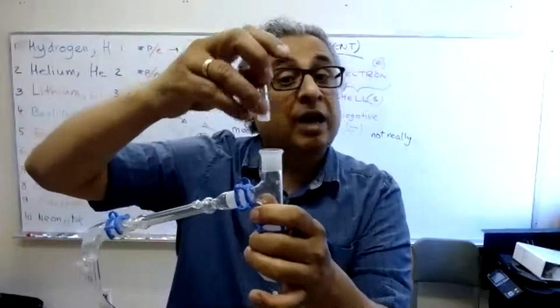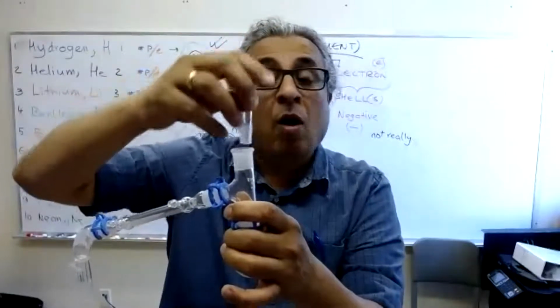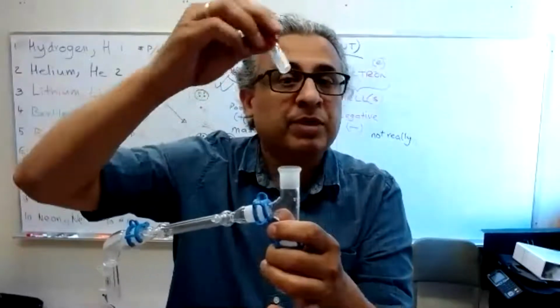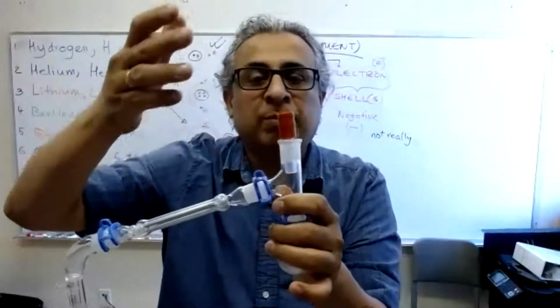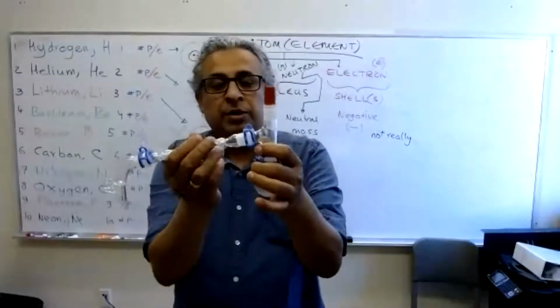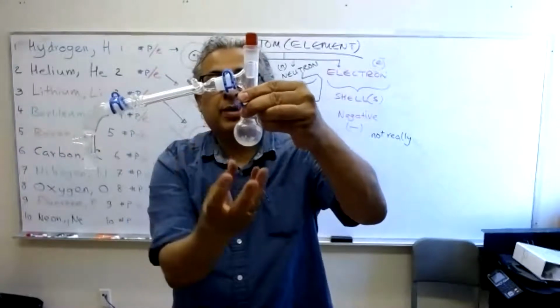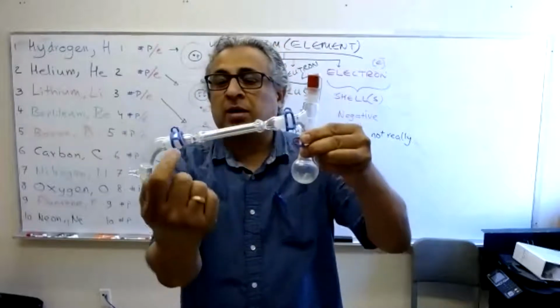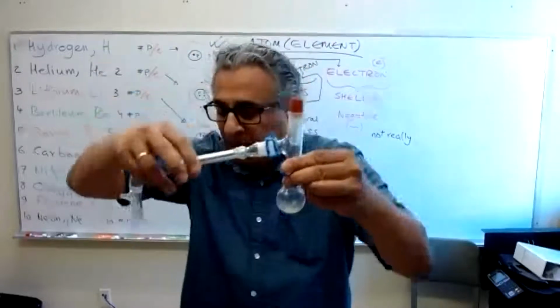Either we use an adapter that converts the 1420 into a 1922, or you use a different thermometer adapter that's bigger, okay? This is smaller. So I'm gonna just set it up here just to prove a point, but this is bad. This is a bad idea. So you take your compound in here, you heat it up using a heating mantle or something, usually not a Bunsen burner, water in, water out, and you put the clamps, different clamps.